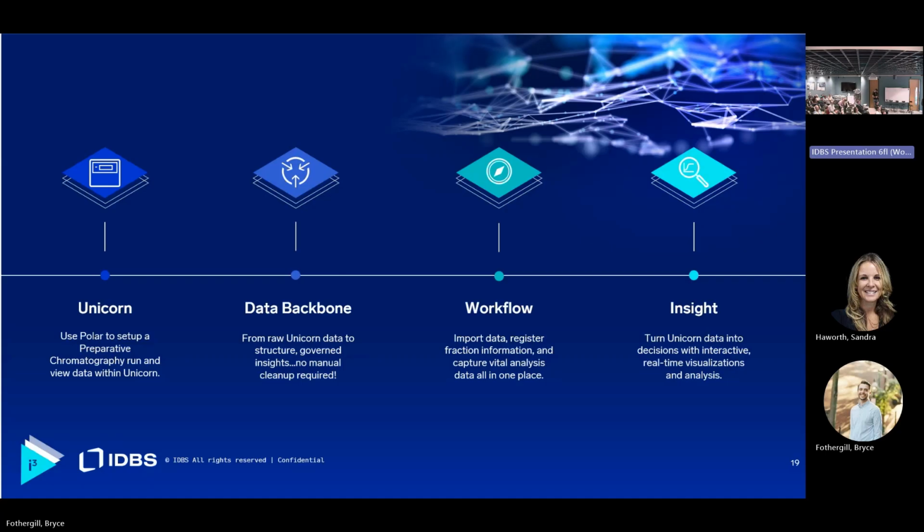All of our Insight apps, or most of them, if not all yet, have an export button at the top where you can click that. You can export that data into a CSV if you so please. But you can export it in any way. You can also export the actual visuals, right? So if you want to take those visuals, paste them into some report, you can do that, PDF, etc. So all of that is easily exportable.